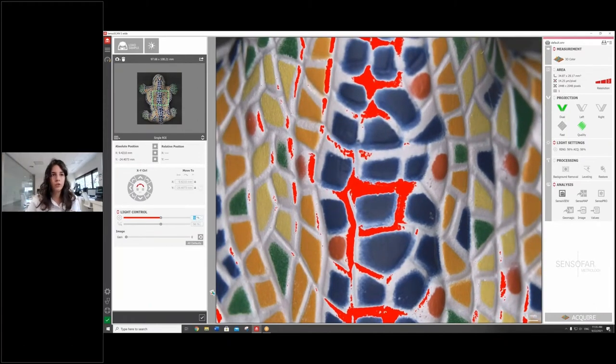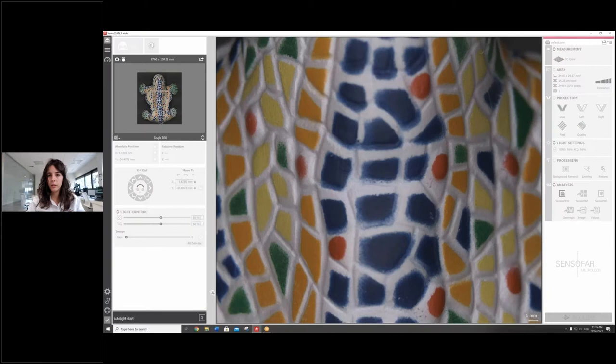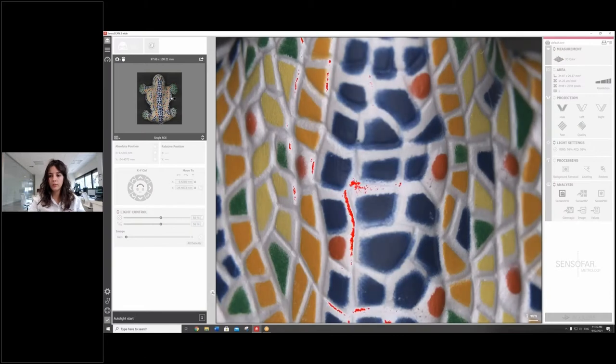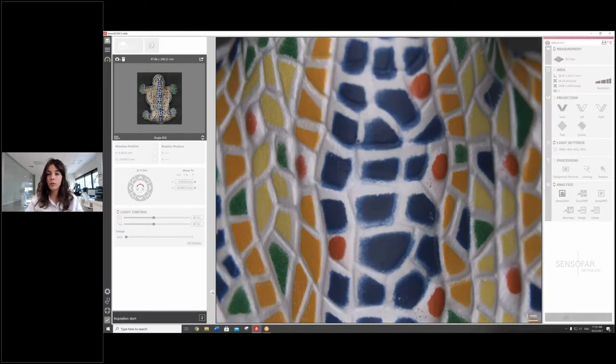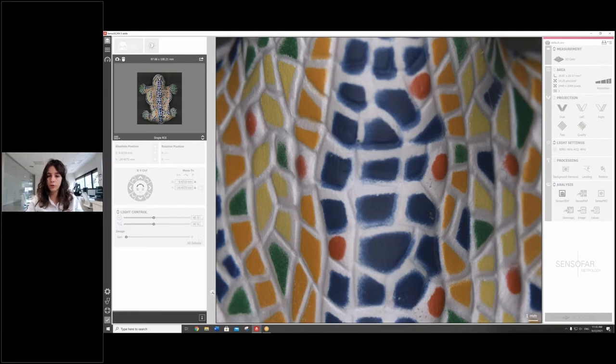We're going to check auto light to make sure that we have the right lighting, and then we just click acquire. So it was only three steps: positioning, auto light, and acquire.